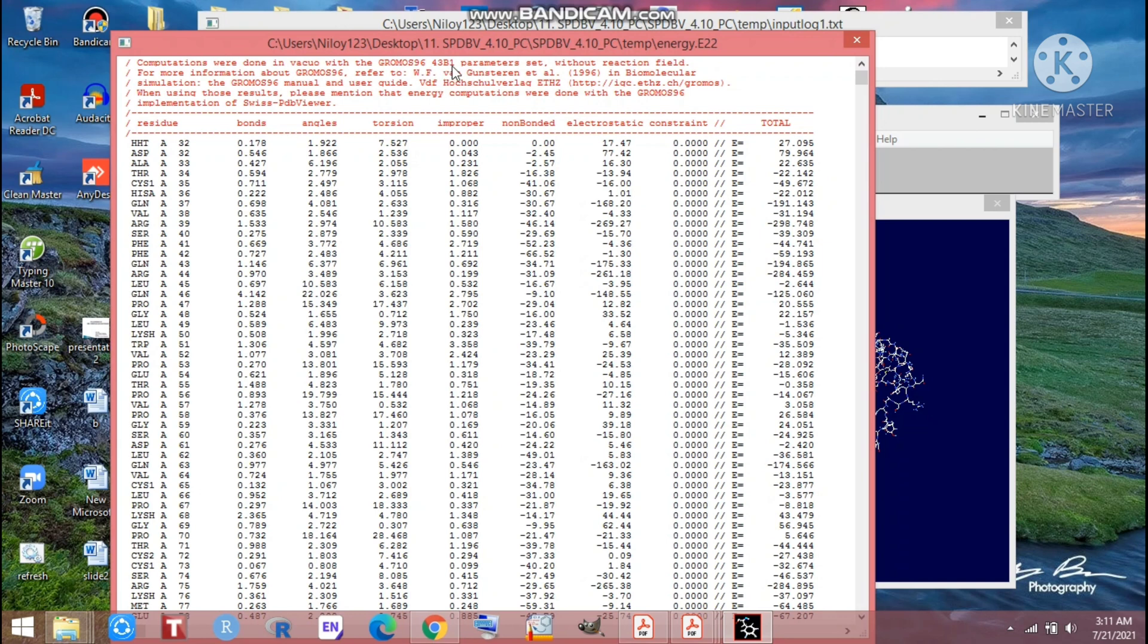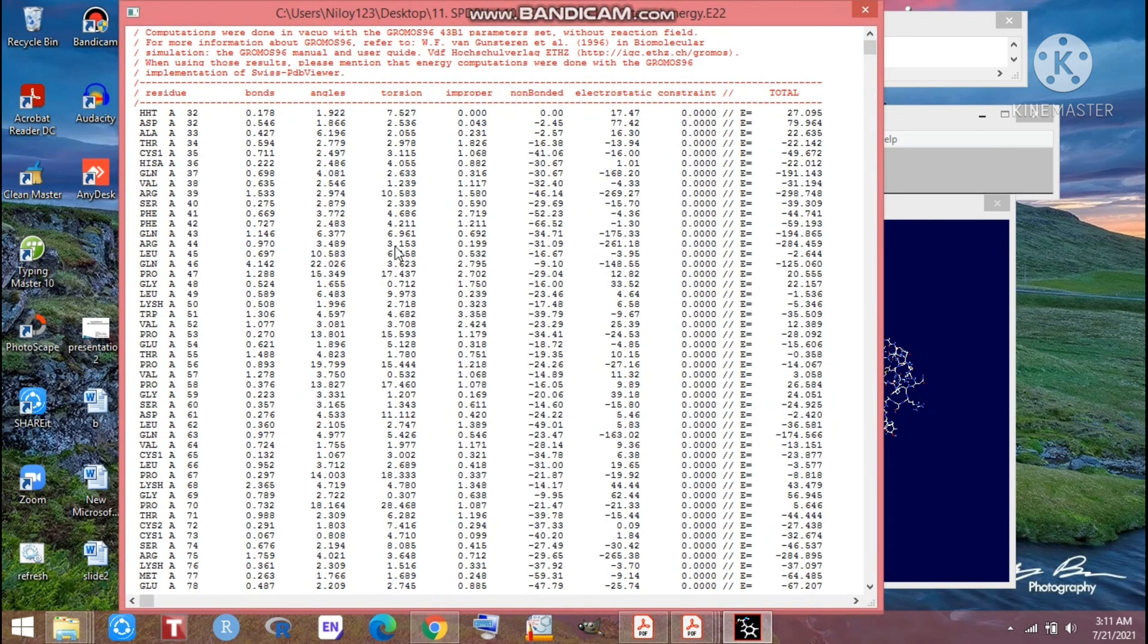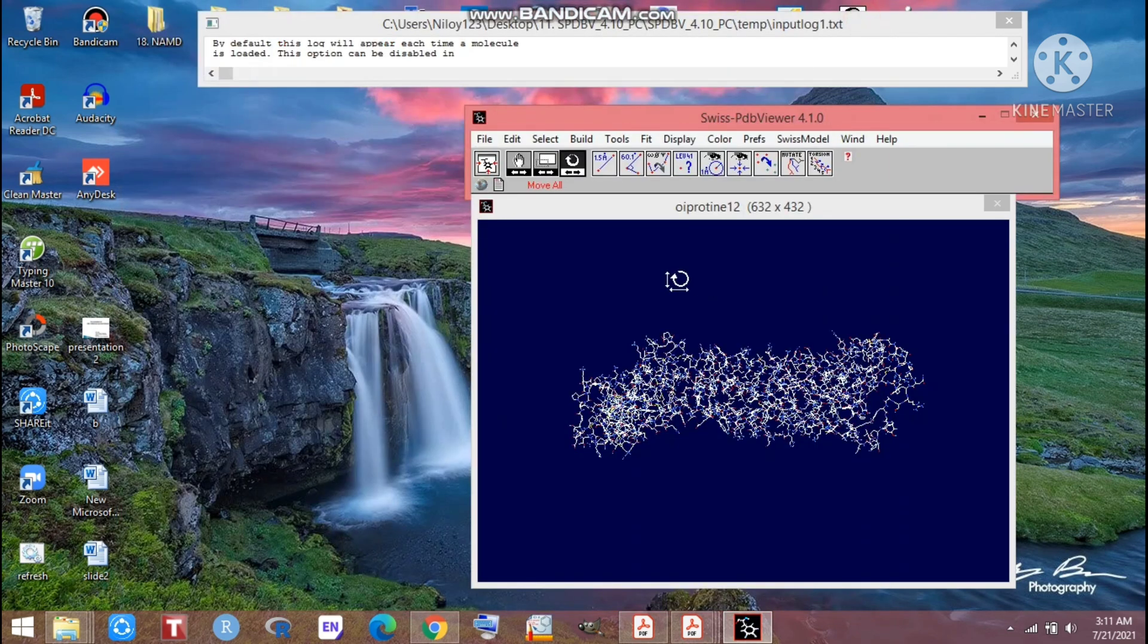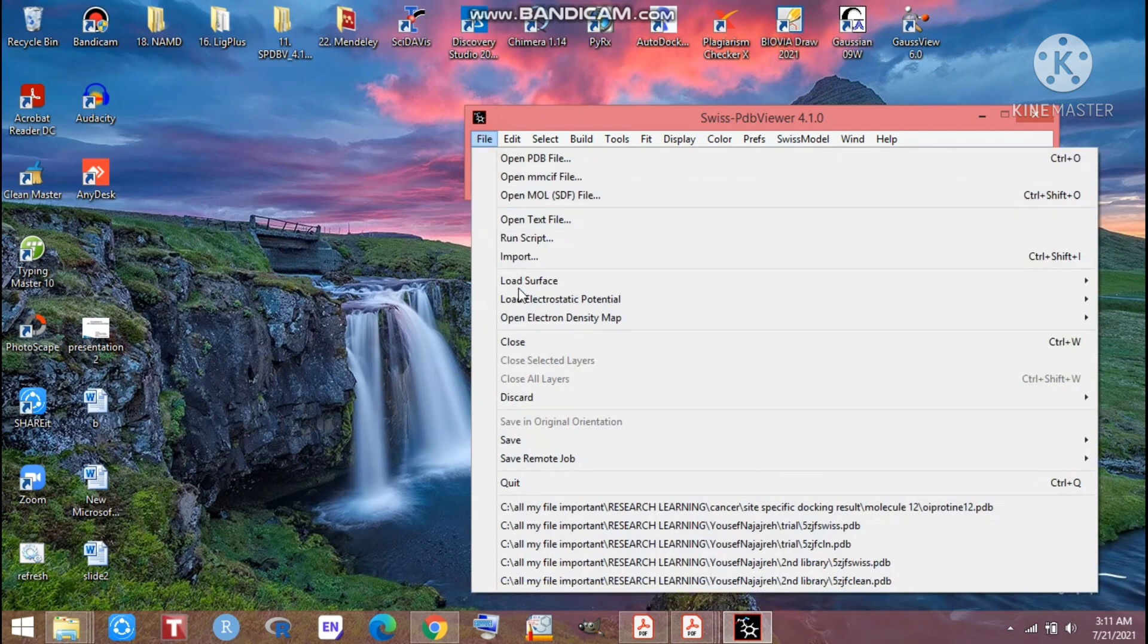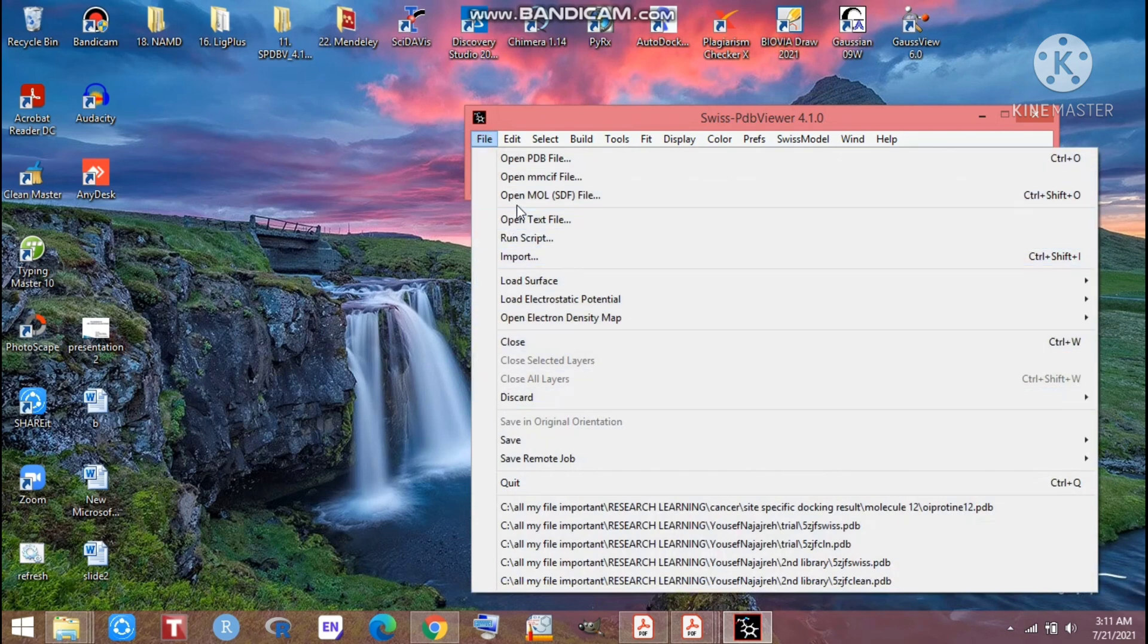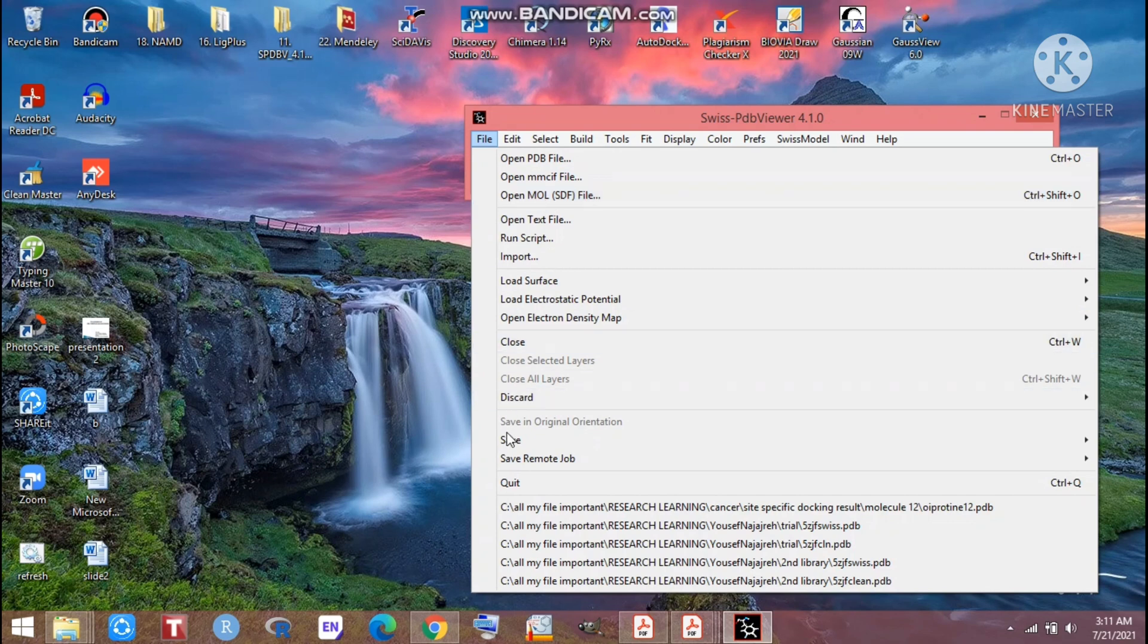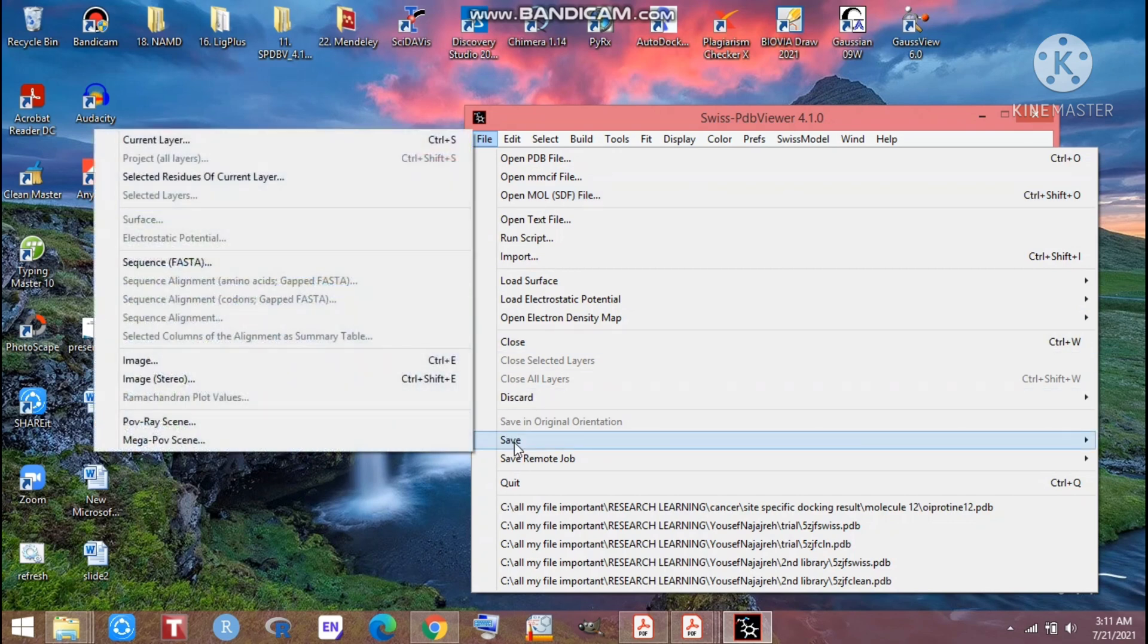That is our energy minimization and we have completed that energy minimization. After completing that, just click on the cross. You can close it. Just go for File and that is the minimized protein, so we can save it. Go for Save.